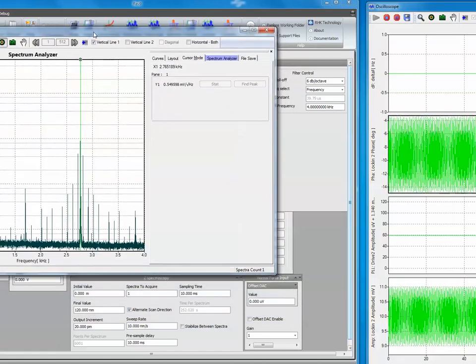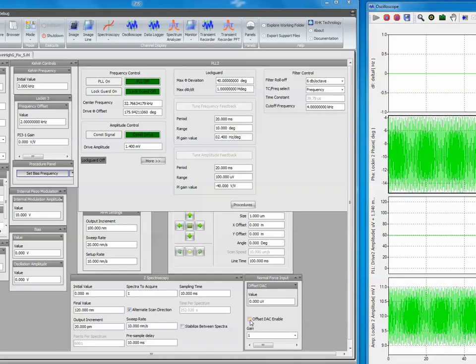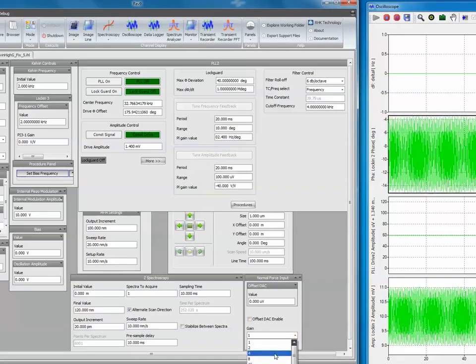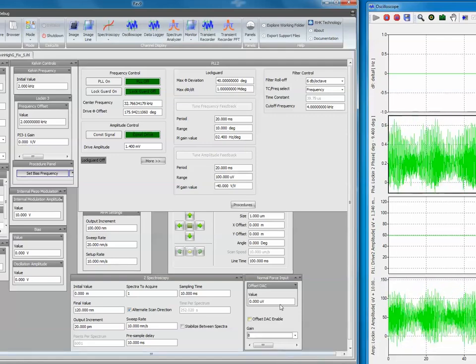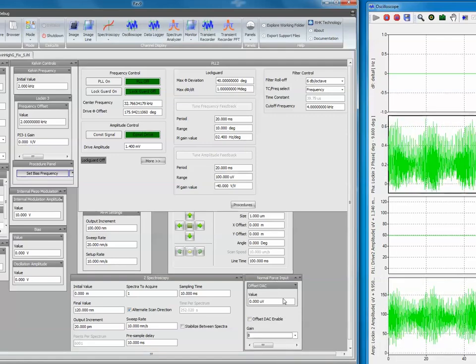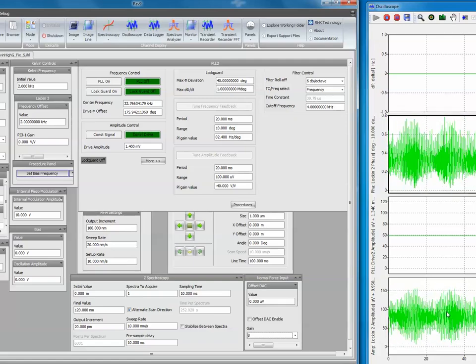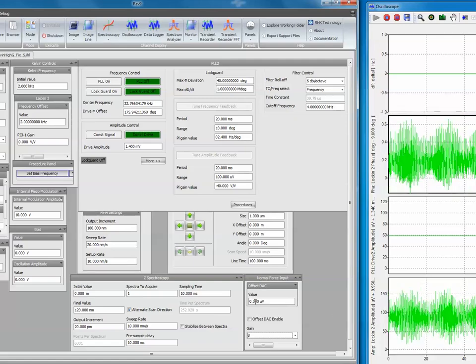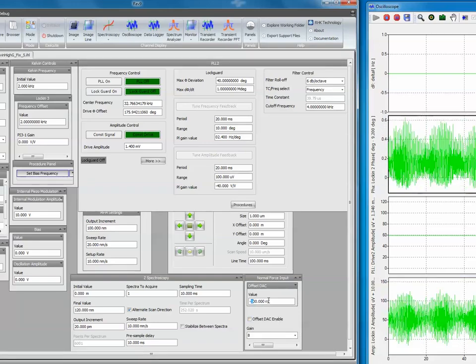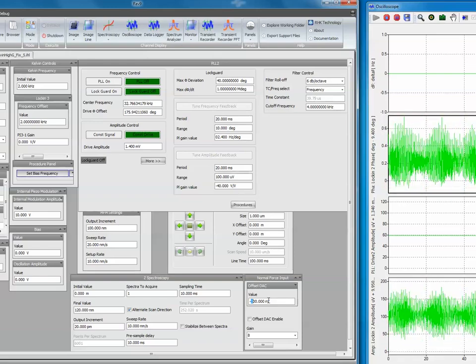Now, the first remedy that we can come up with is to compensate for the offset. But before that, I'd like to change the gain to a gain of 8, because we don't use all the input range anyway, and this already reduces the amount of noise dramatically. Now the next thing to do would be to reduce the offset.